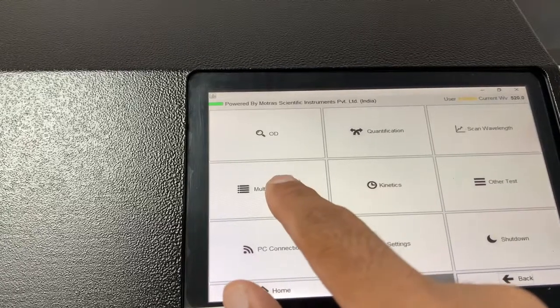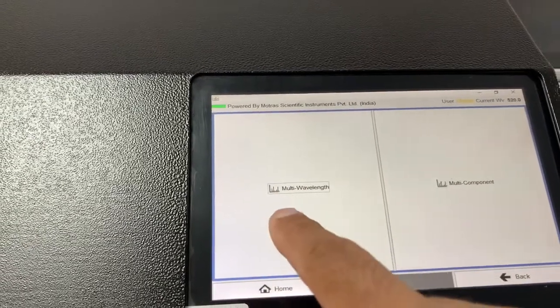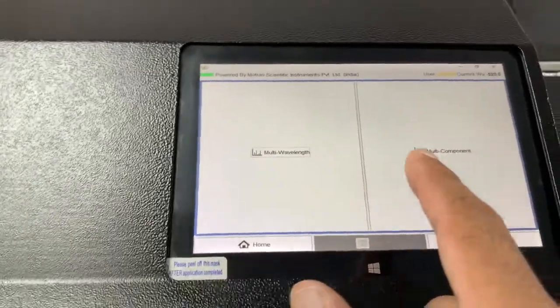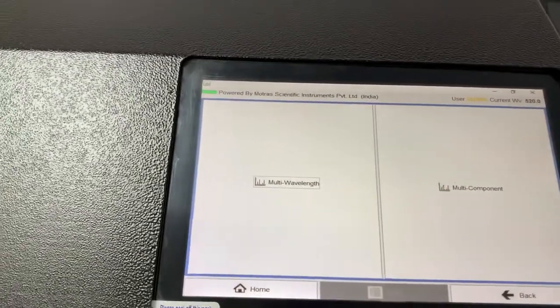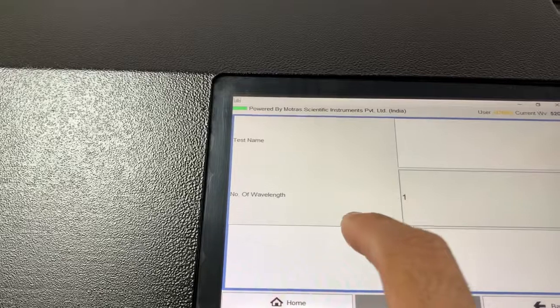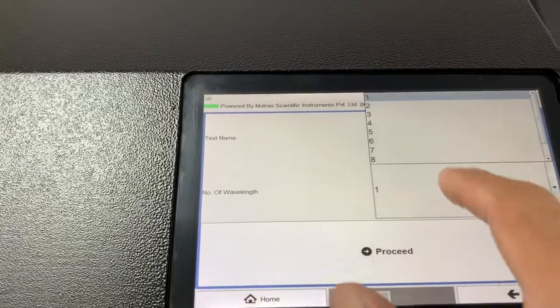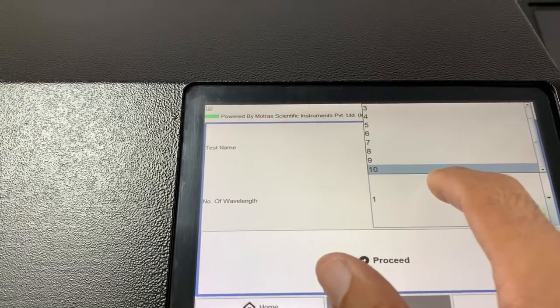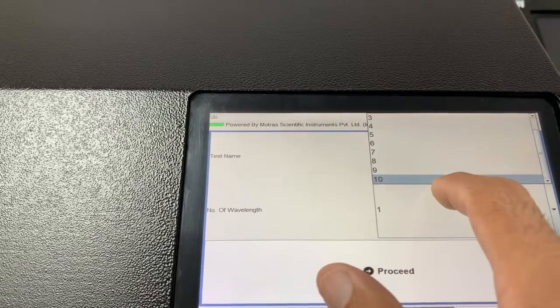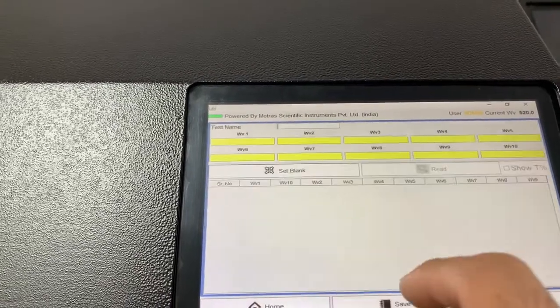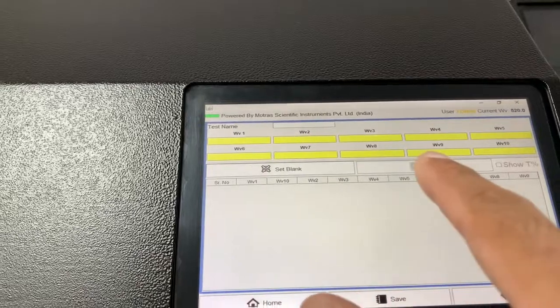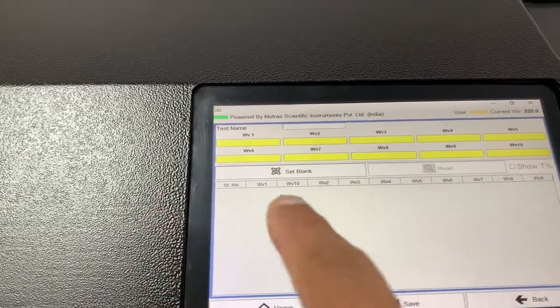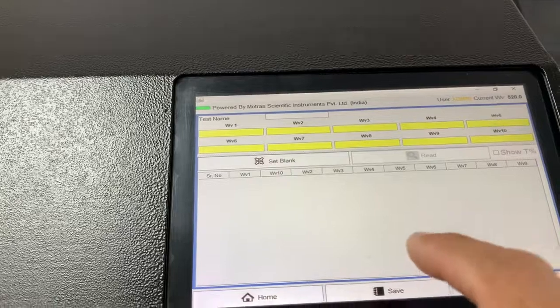Then we have multi-wavelength test. In multi-wavelength, we have multi-wavelength and multi-component as well. In multi-wavelength, you have a choice of the number of wavelengths you want to do analysis for — you can add up to 10 discrete wavelengths and the system will give you readings for all 10.